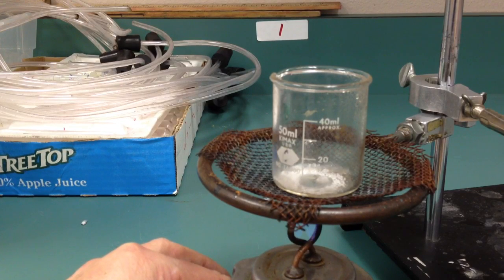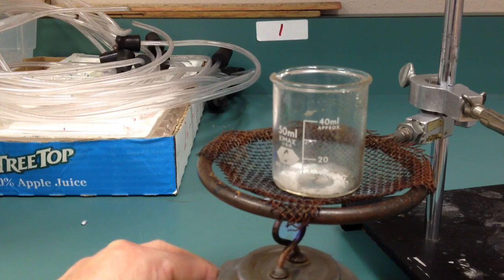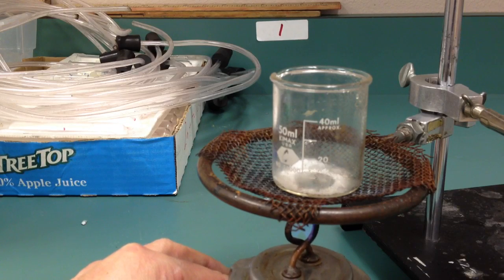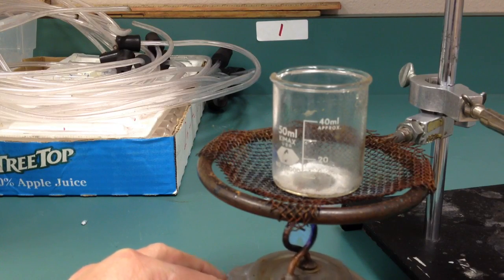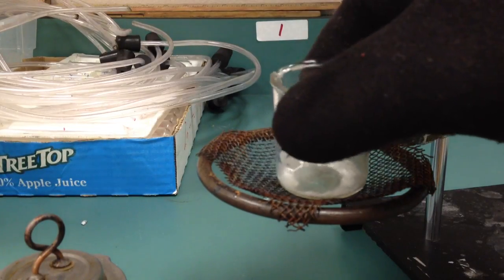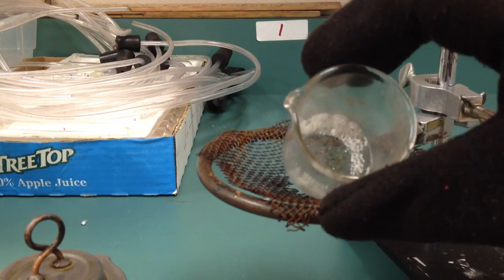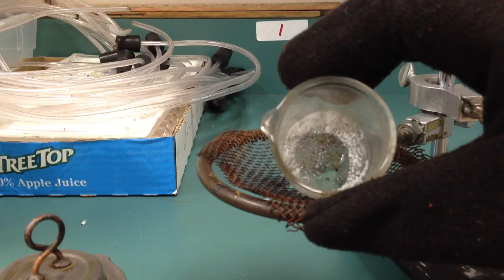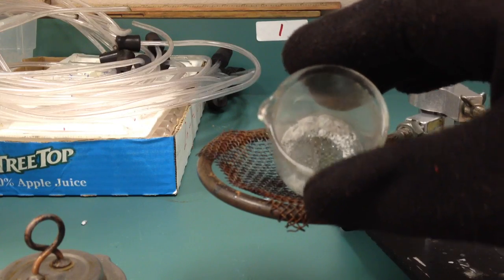Nice. All right, there we go. Blow that out. Show you what it looks like. So, there's the white crystals that form from the zinc chloride. Okay, and so that's the reaction.